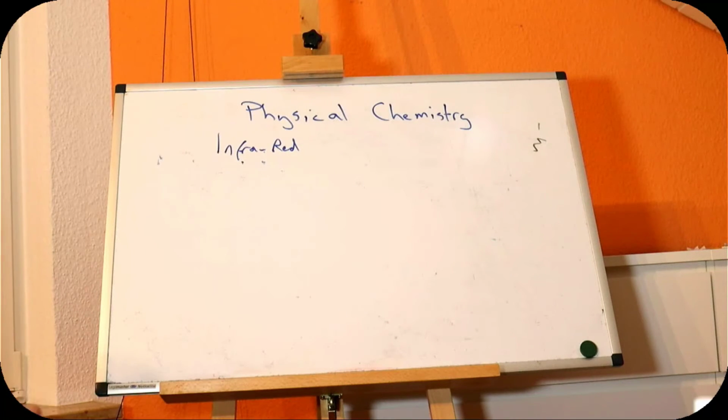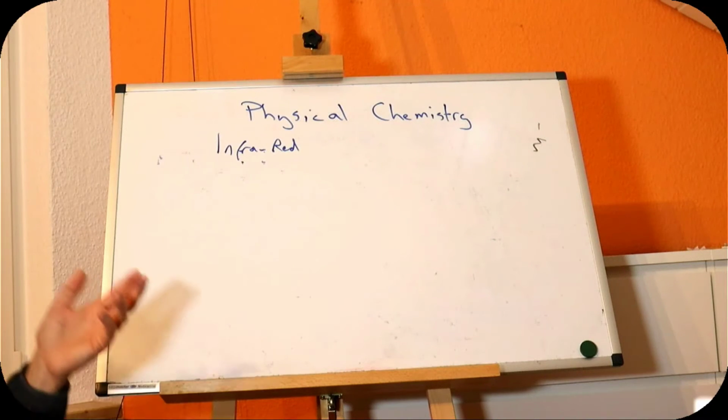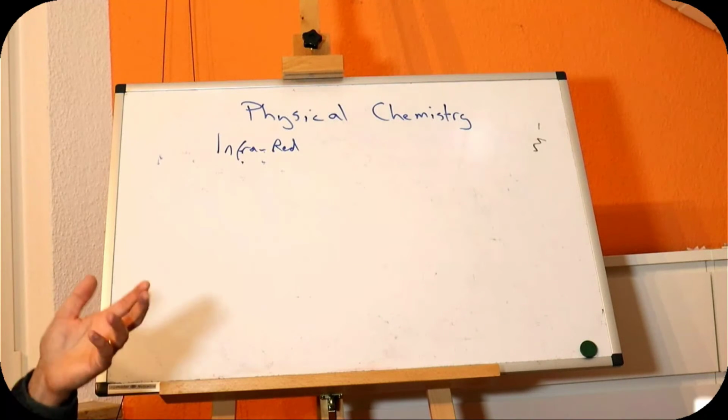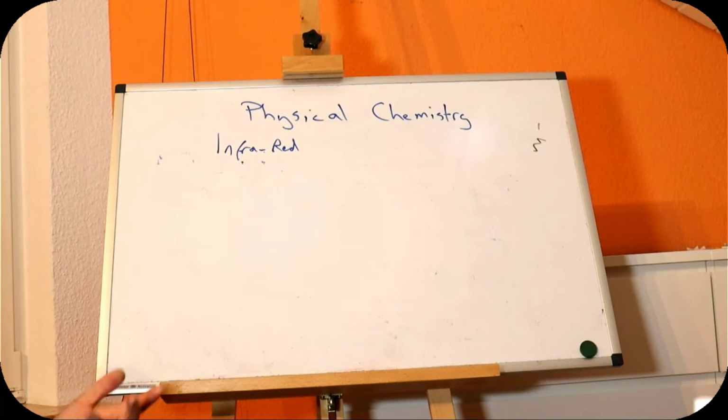Also, most of the energy that we put into our sample in Raman is not doing anything. So pretty much 1 in a million of the photons actually turns into a Raman photon. All of the other ones are scattered and just go somewhere else and end up as heat. But also, even the Raman photons, many of them are not going in the direction that we want. And most of the energy in the light is in the light to start with, and it's in the light in the end. Whereas in the infrared, if it's absorbed, all of the light goes into the vibration.